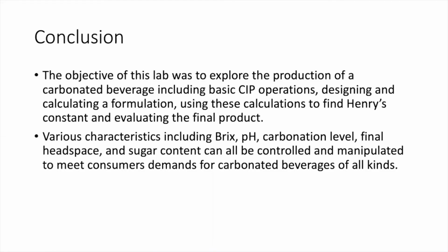In conclusion, the objective of this lab was to explore the production of a carbonated beverage, including all the clean-in-place procedures, designing and calculating a formulation for the beverage, using these calculations to then find Henry's constant, and then evaluating the final product. Various characteristics, including Brix, pH, carbonation level, final headspace, and sugar content, can all be controlled and manipulated to meet consumers' demands for carbonated beverages of all kinds.